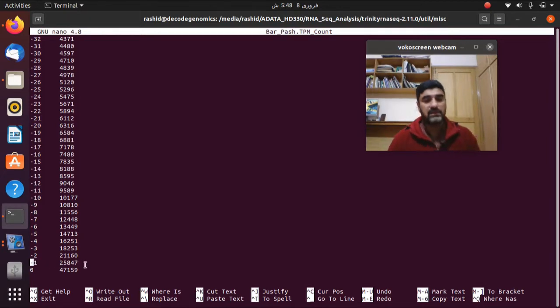So this is just giving you an idea that at very strict conditions of the TPM, very few genes are expressed.